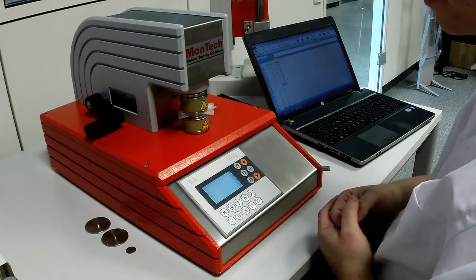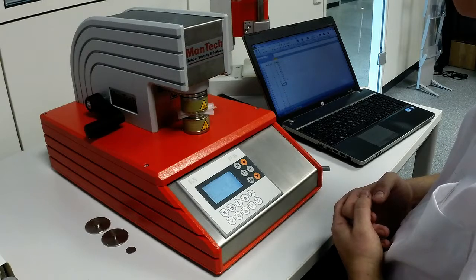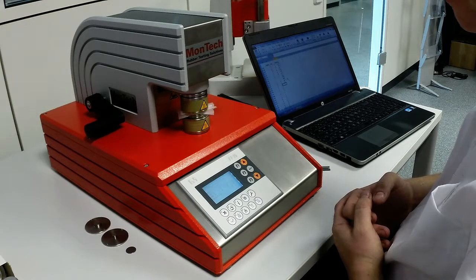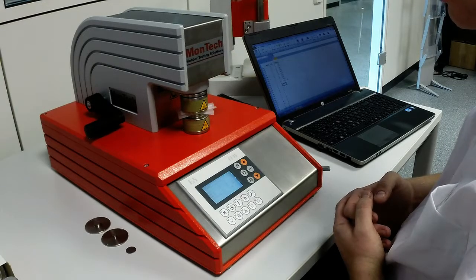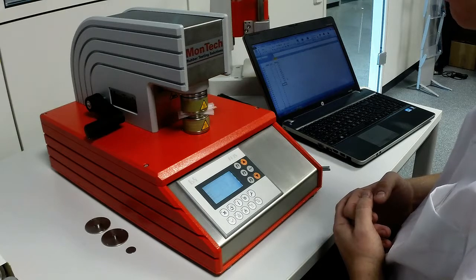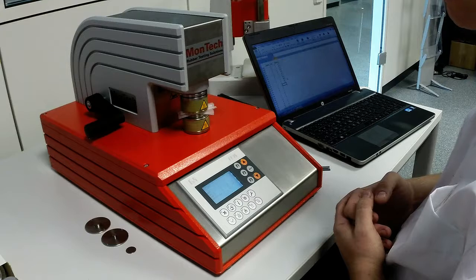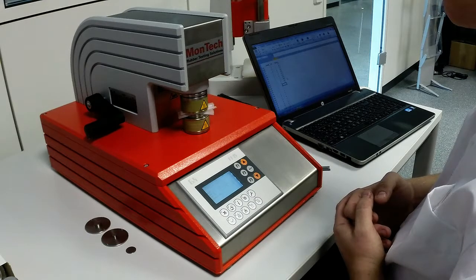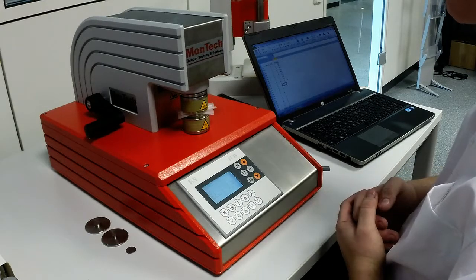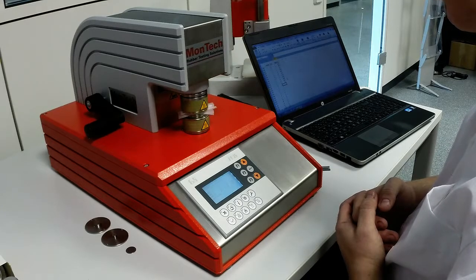Of course, the instrument can optionally be equipped with automatic data recording software. This software allows not only to record final results, but also automatically calculate plasticity retention index (PRI), as well as record the plasticity decay curve during the load time.